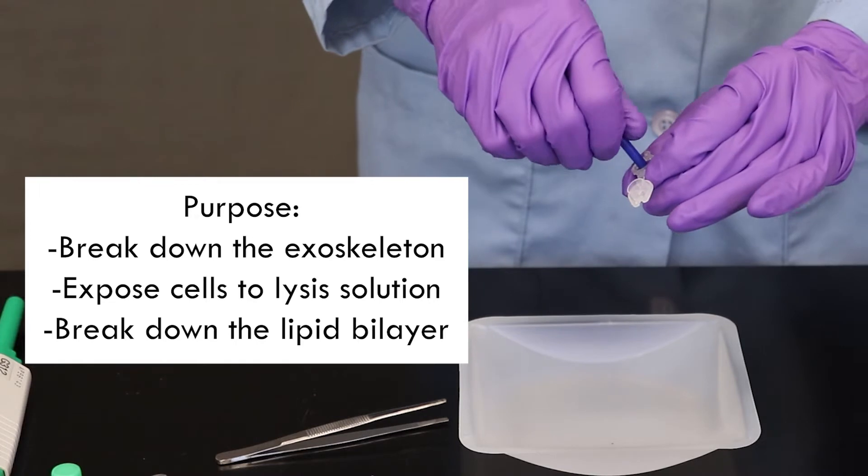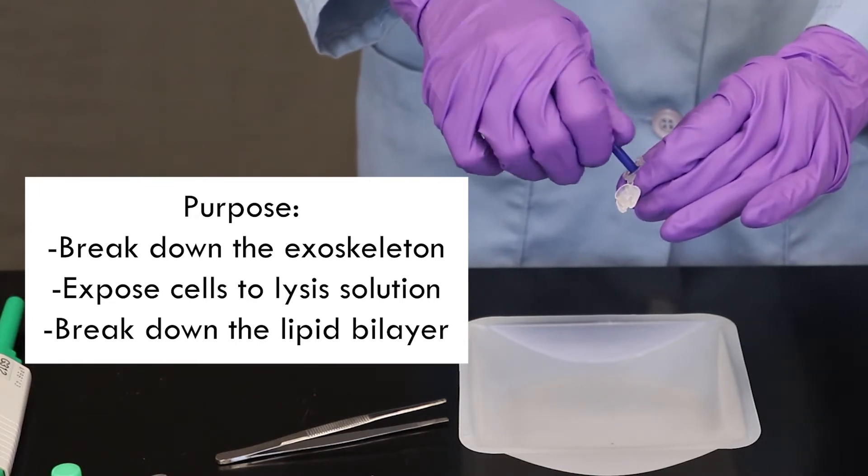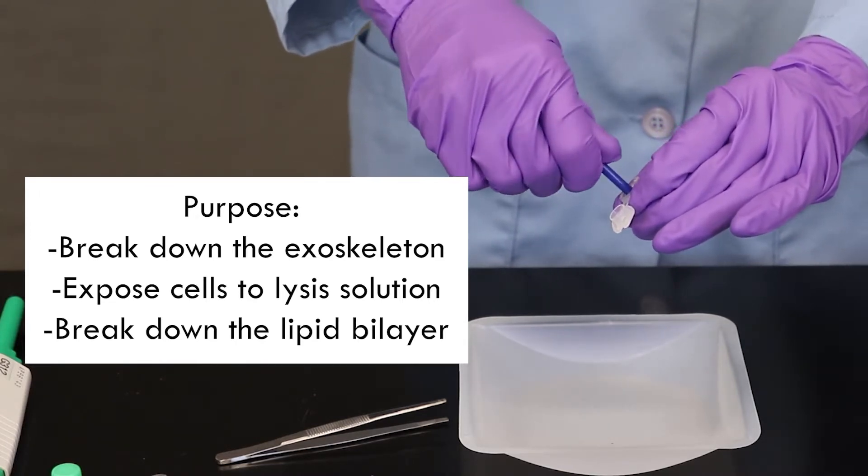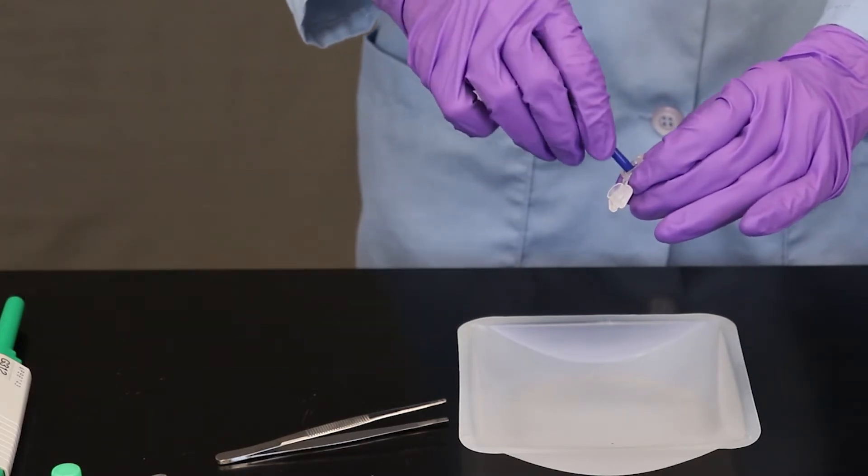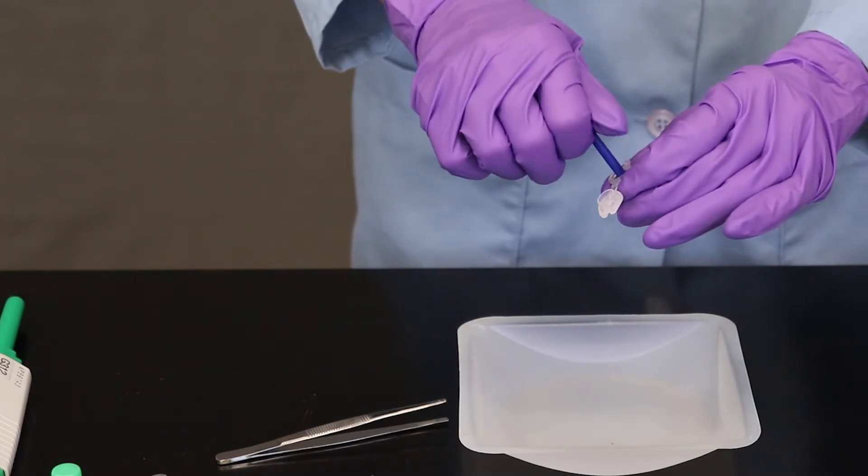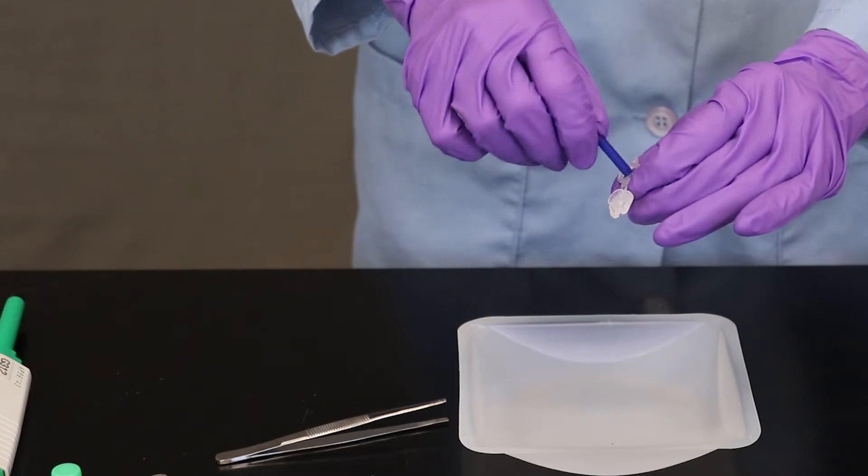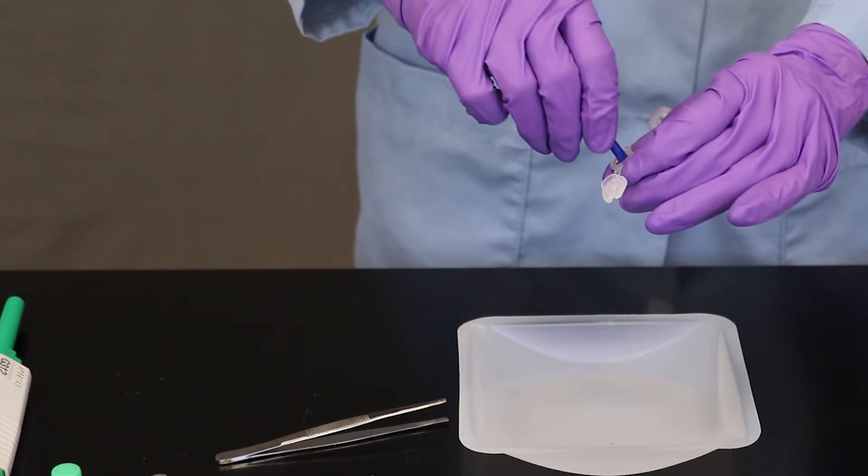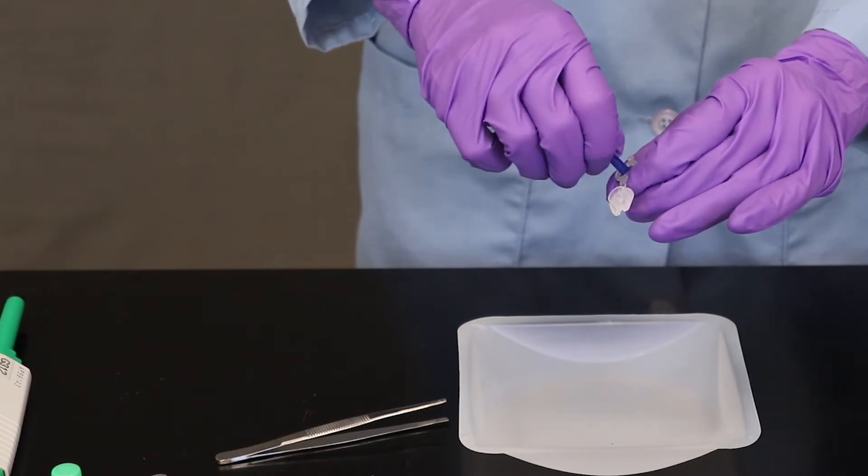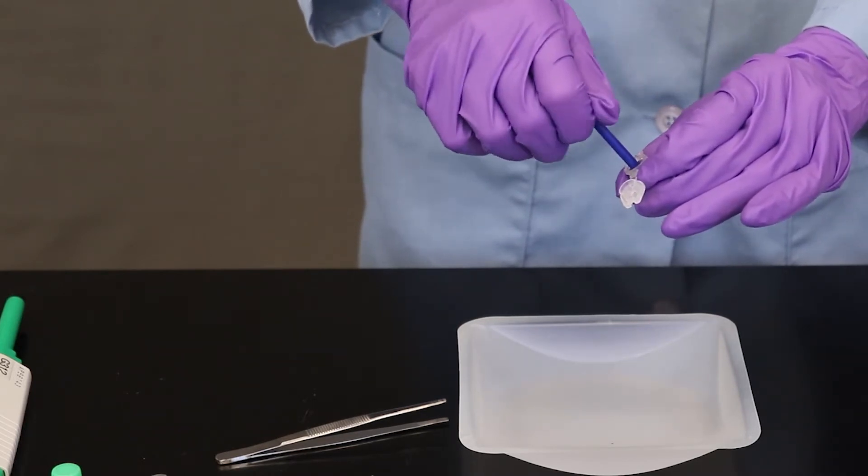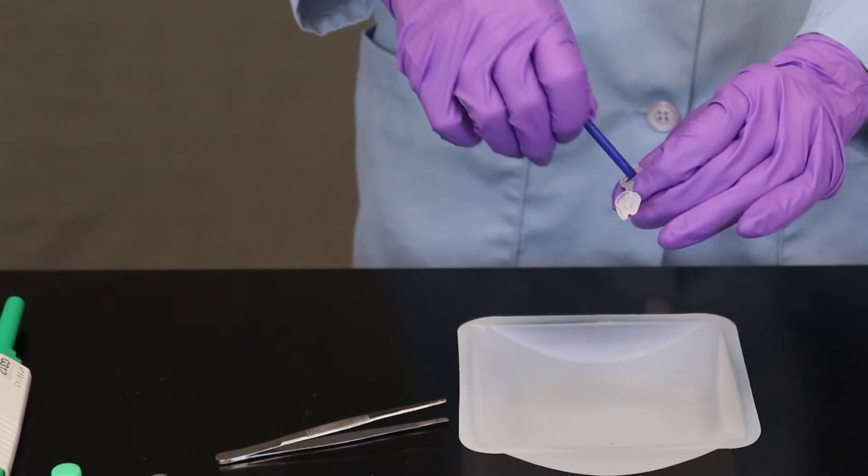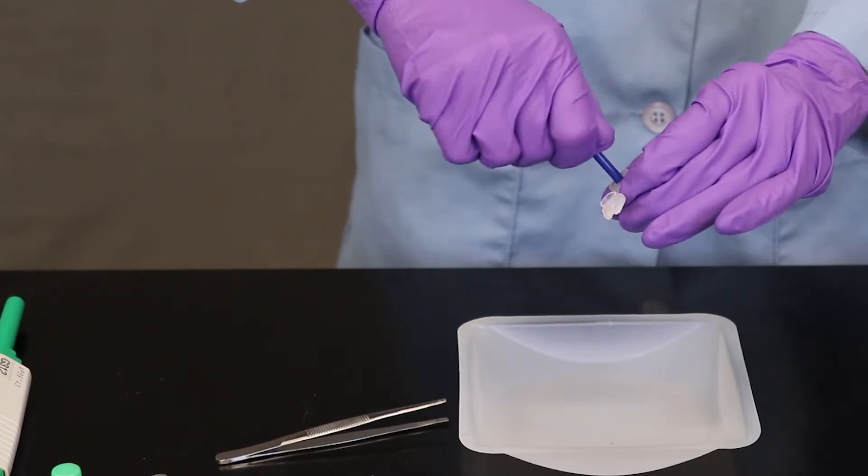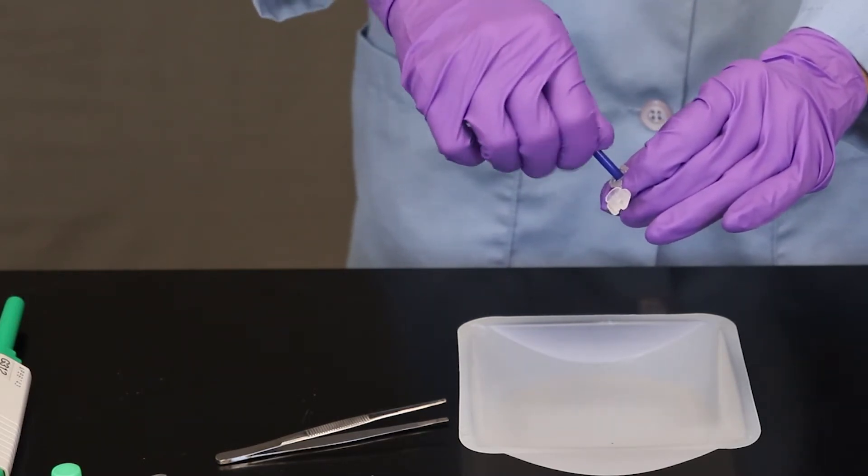And the purpose of this is to break down the exoskeleton so that it can expose the cells to the lysis solution. And the lysis solution with the detergent will help to break apart the lipid bilayer of the cell membrane. So just like dish detergent breaks up grease in dish water, this detergent should break apart the cell membranes. So the hope is to expose those cells so we can break them down and get the DNA out of them.